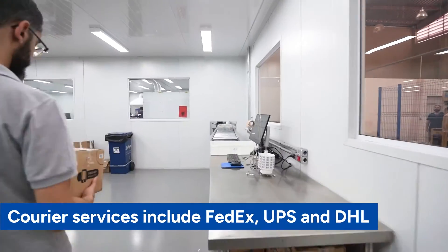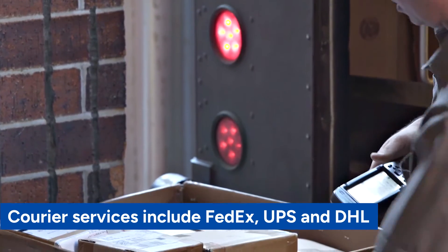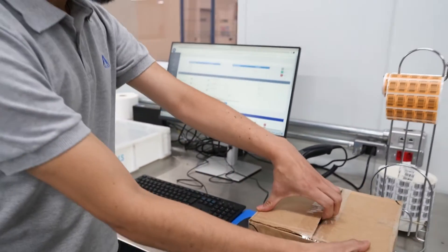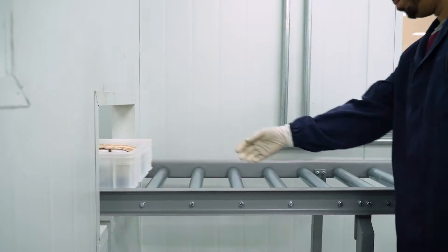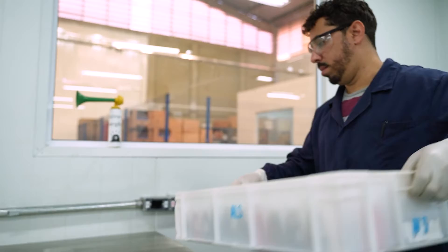Samples arrive into the laboratory via various courier services. Samples are unpacked and brought over to the sample entry area. The sample is logged in with the drop-off time, date, and other relevant data.